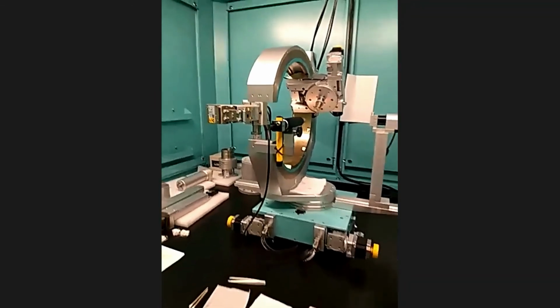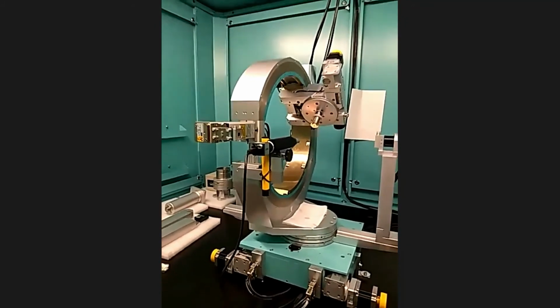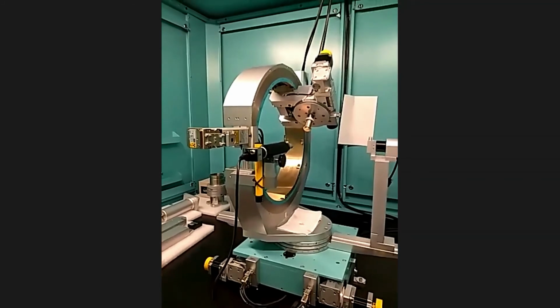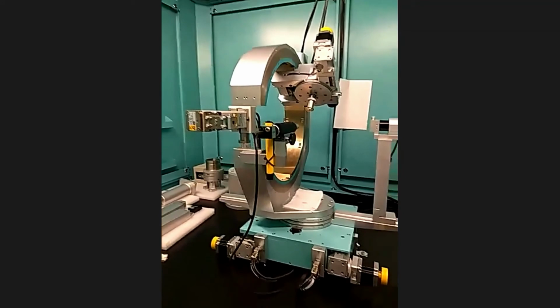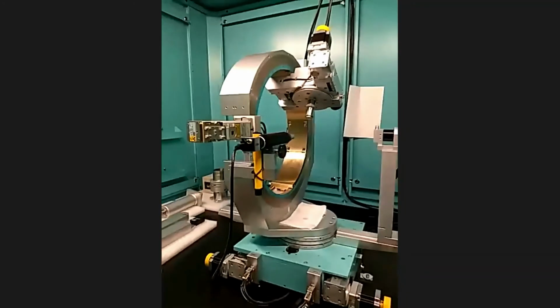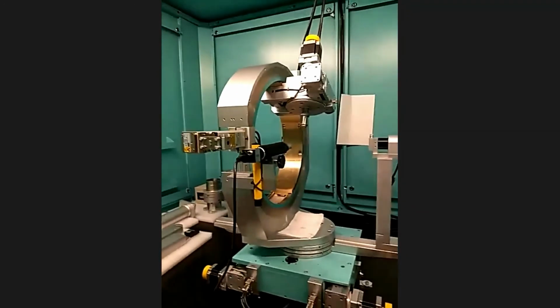So if there is no other question, yeah, right? Yes, that's a good question. When I need an extra example of phi, imagine I'm thinking in terms of domains. For example, any sample that we have in single crystals. What we have discussed so far is thin film materials, which is like a slab on a substrate.